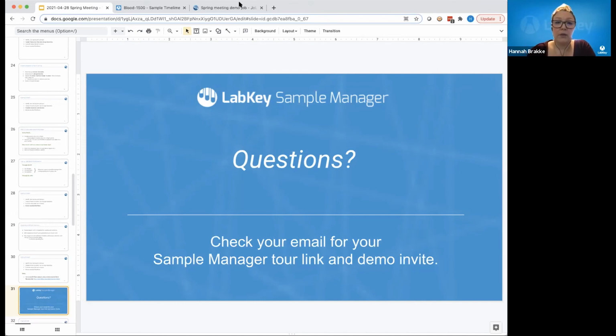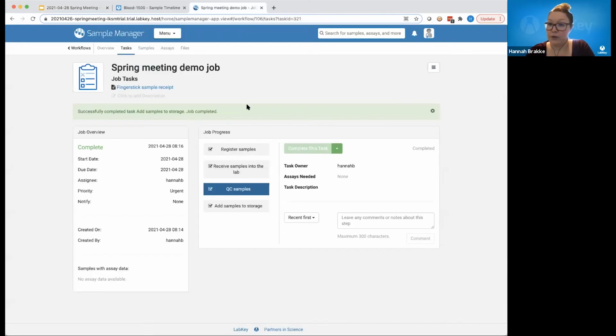Mostly the roles that we have for users in Sample Manager are administrator, editor, or reader. And administrators really are sort of the site demigods, as you will. They can set up the structures of sources and samples and freezers and be able to change those names. I would love to talk to that user more to see about what their use case is. So in that case, the admin would be able to do those things.